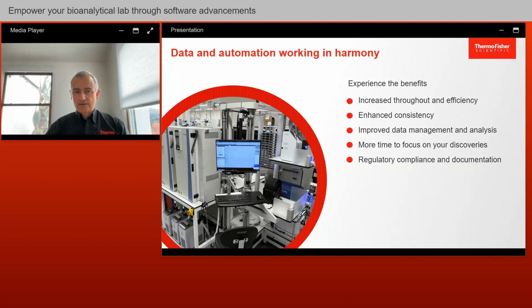So obviously, by bringing in digital automation, you can ensure that you make fewer mistakes in transcription of data from instruments to your system of record. You can remove some of the tedious calculations that you may have to do. Even with the most diligent work, you're going to make 1% to 2% of errors even in transcription when you put maths or any sort of stress in the situation.